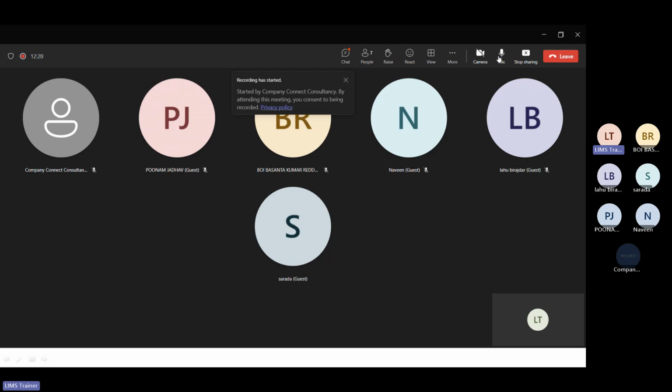Is anyone here from pharma background? Anyone from pharma background? Yes, I am from pharma background. Okay, fine. Anyone from biotech, IT, IT background? Okay, clinical trials? Yes. If you are from any other profession beyond these, you can share with me.